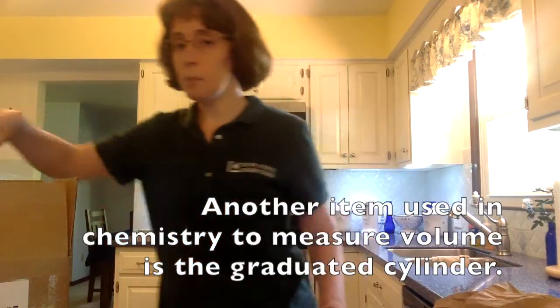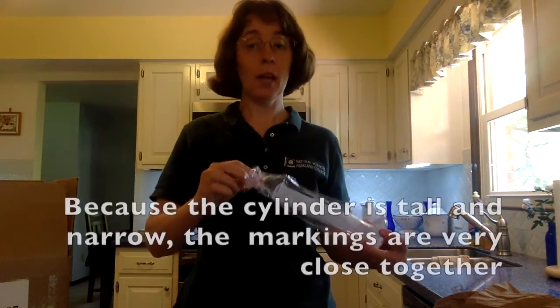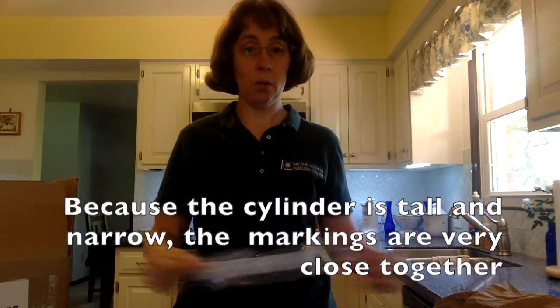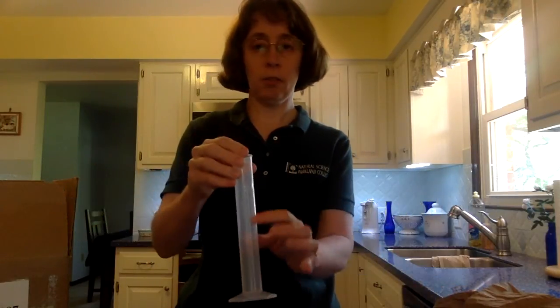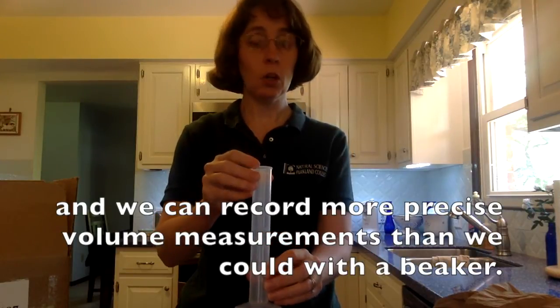Another item used in chemistry to measure volume is the graduated cylinder. Because the cylinder is tall and narrow, the markings are very close together, and we can record more precise volume measurements than we could with a beaker.